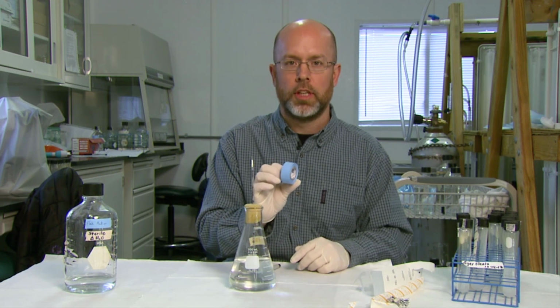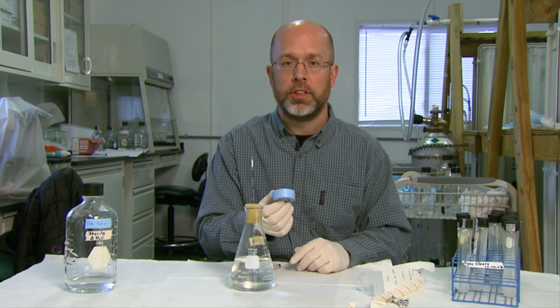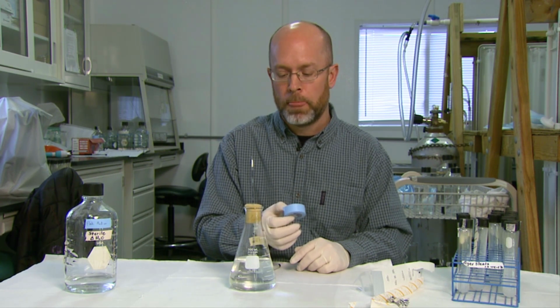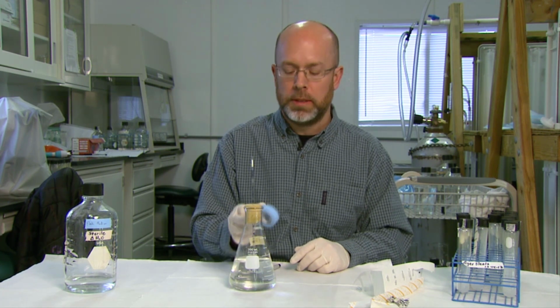The next step is to transfer the inoculum to the flask, but I can't stress enough, it's important before you do that to put a label on this flask. We like to use colored tape, and you can even use a particular color for a particular algae species if you like to keep things straight. Once this inoculum goes in here, a lot of these species are green. You're not going to have any idea what species you have.